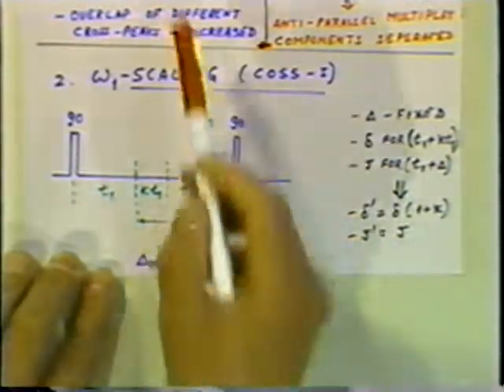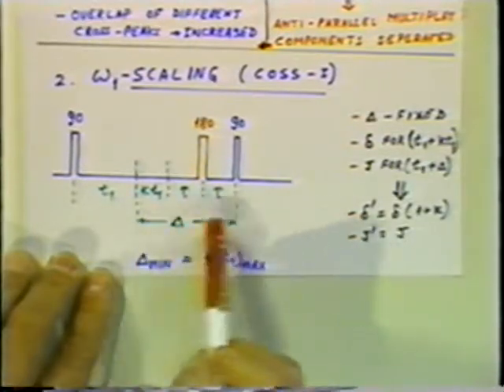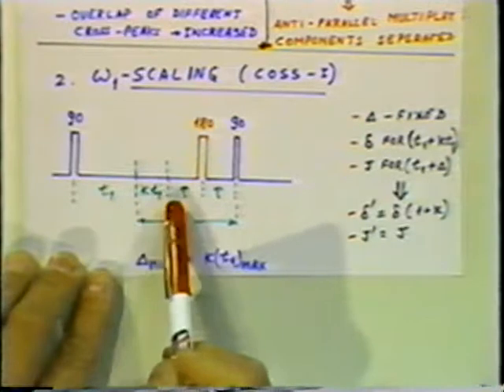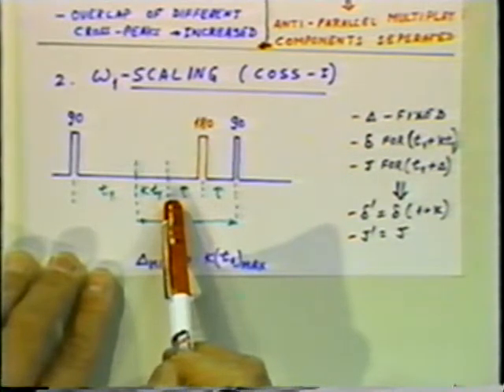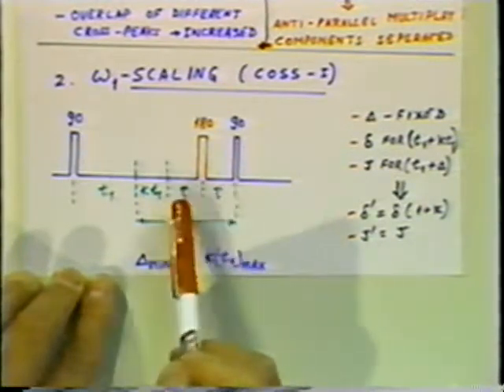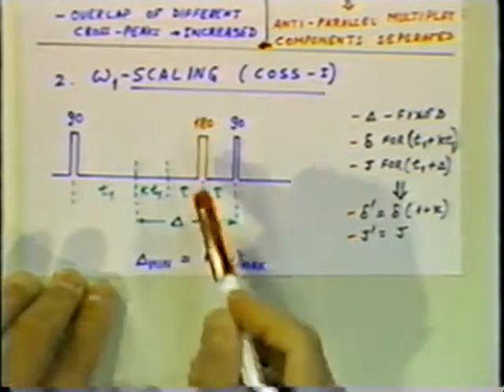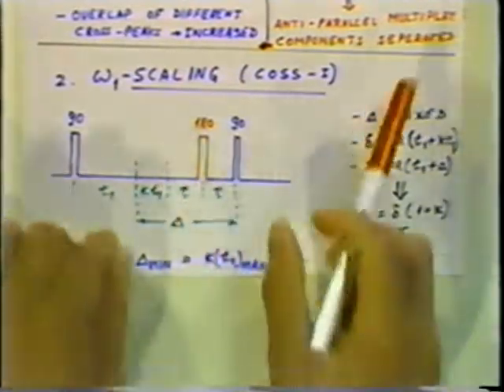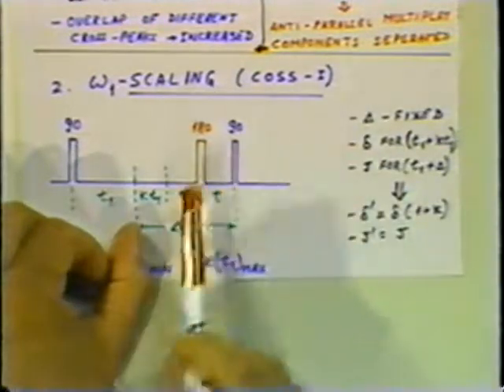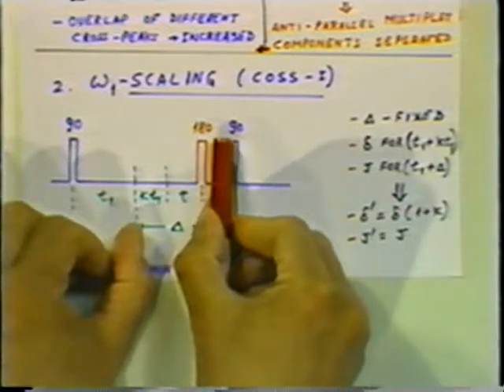We have this period here. We actually add a constant period, out of which part is utilized for chemical shift evolution, and part is not utilized for chemical shift evolution. This pulse is right in the middle of this delta period for the first T1 experiment, and as T1 increases, this 180-degree pulse from the middle just goes nearer and nearer to the 90-degree pulse.